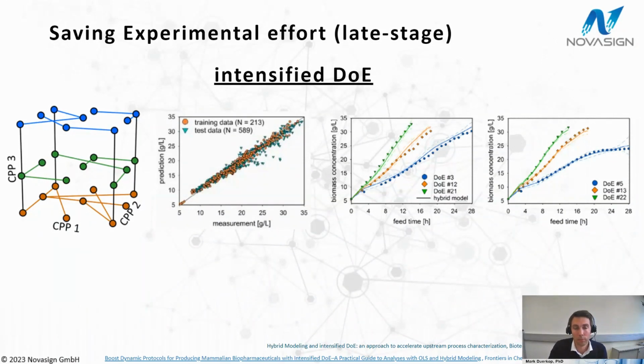So we start from the top left corner, go to the center, and then go to the bottom left corner, and this is one experiment. By doing so, you can pack multiple experiments into a single experiment, and by that basically are able to describe the design space much faster. So rather than doing 27 experiments, in this case, we only perform 9 experiments.